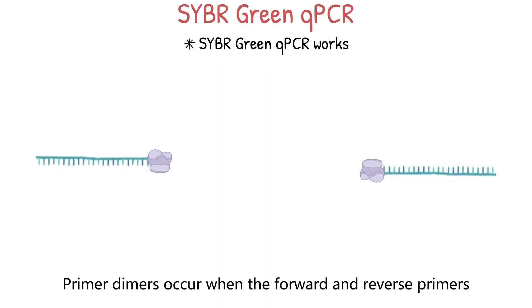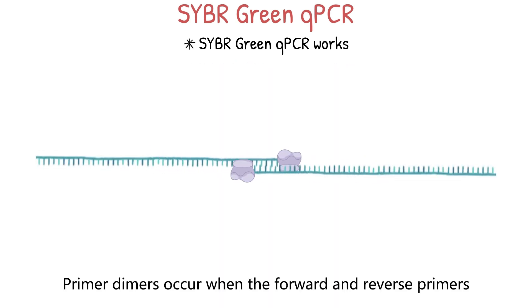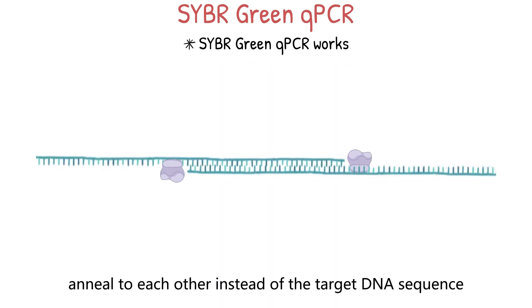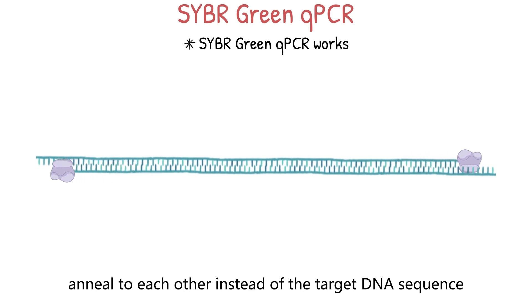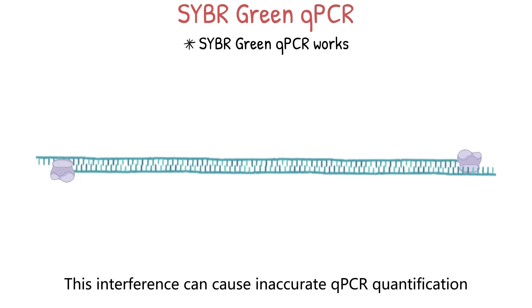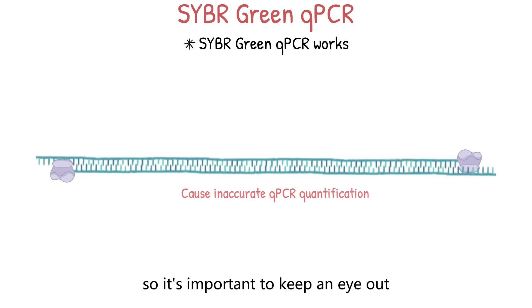Primer dimers occur when the forward and reverse primers anneal to each other instead of the target DNA sequence. This interference can cause inaccurate qPCR quantification, so it's important to watch for them during melting curve analysis.